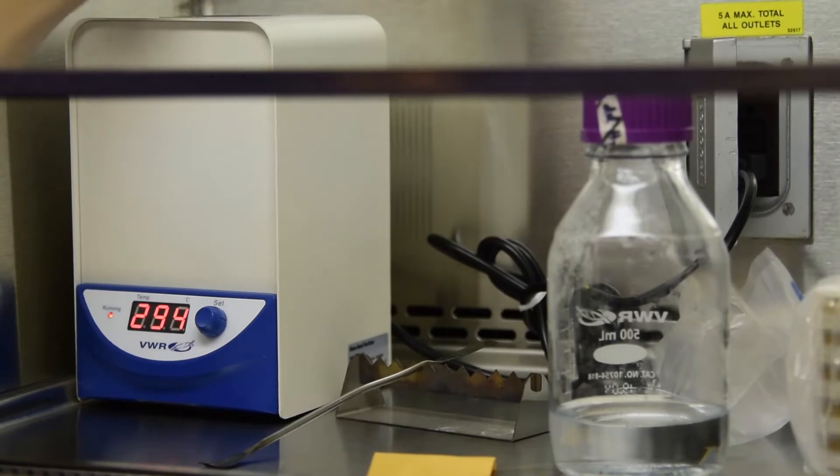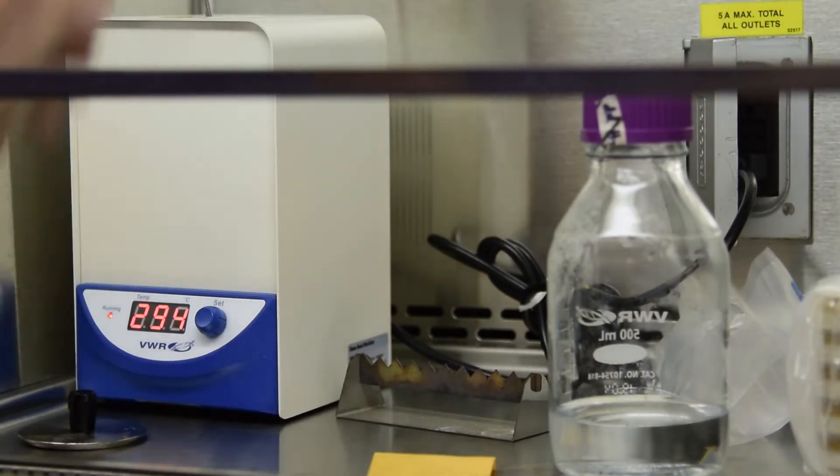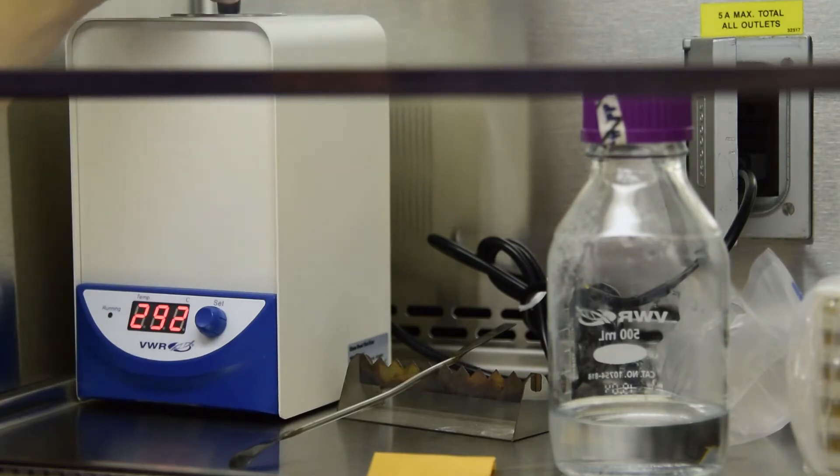Once the sterilizer is at temperature, place your spatula in for at least 10 seconds, then let cool on the metal rack. Replace the lid to retain heat.